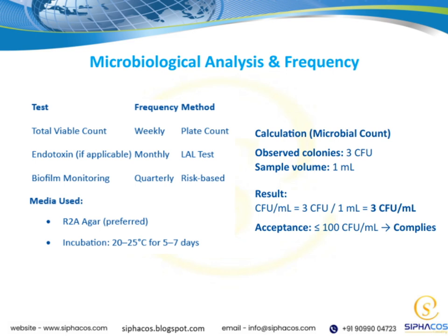This calculation is a key part of microbiological analysis, as it helps us determine whether the microbial levels in a sample are within safe and acceptable limits. Consistent monitoring and analysis like this are essential to ensure product quality and safety throughout the process.